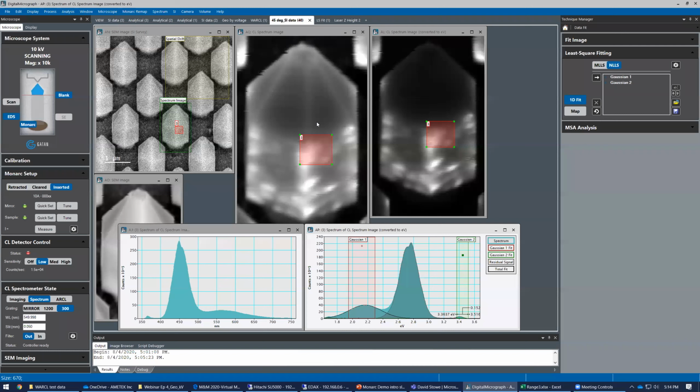All the instrument will tell you is what light came out at what wavelength, and in wavelength and angular mode, you can get information about the wavelengths and what directions they were emitted. So you can actually decode or decompose the plasmonic modes or photonic modes that would be in a specimen like this.